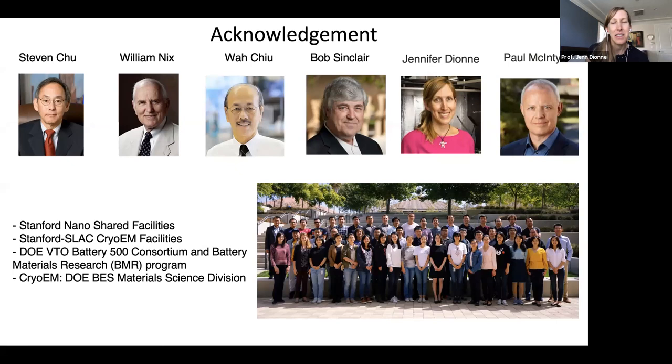Yi, the first question comes from Eva Olson, which is: do you foresee being able to combine cryo-electron microscopy with dynamic studies using, for example, ETEM or the nanofactory holder? So Eva, this is an amazing question. This is one of the dreams we would like to have.